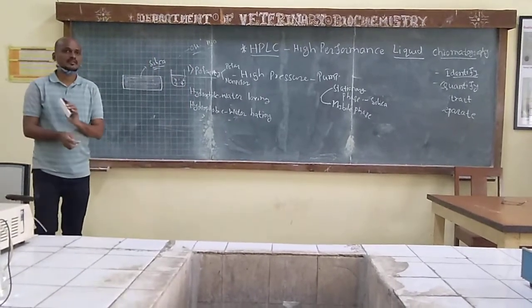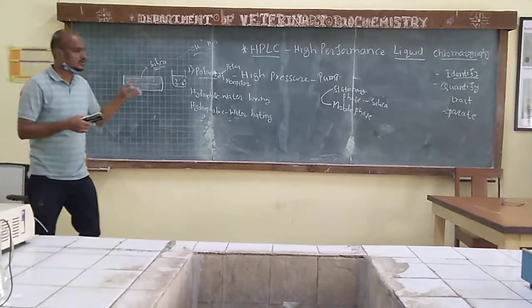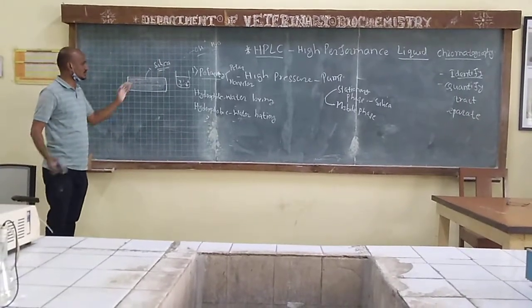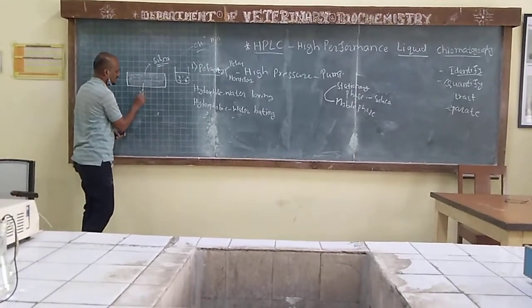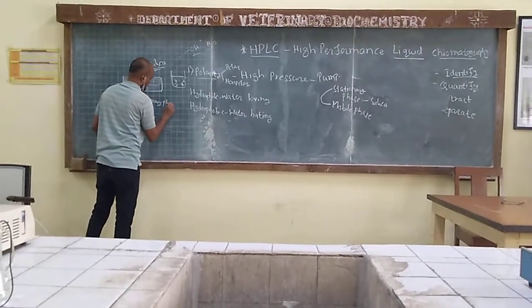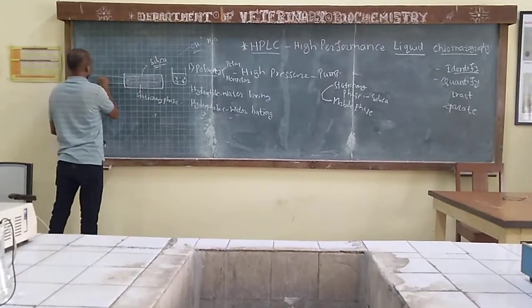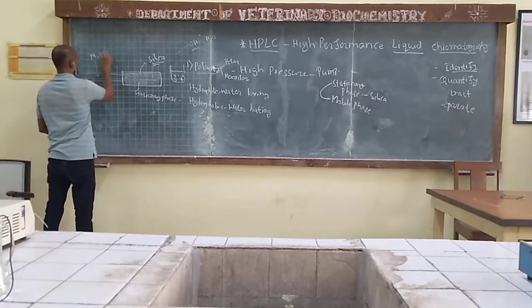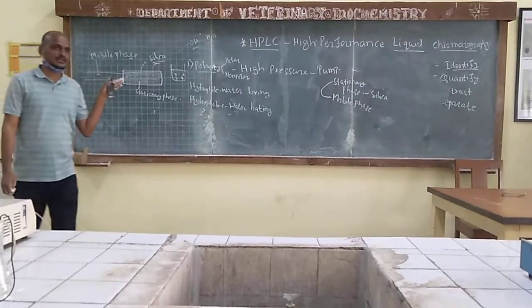Pressure difference. No, the pressure we create. We create the pressure with this pump when we are passing the molecule. Basically, we are taking the stationary phase here, right? We are packing the column with the stationary phase. Then we are passing the mobile phase to that column.